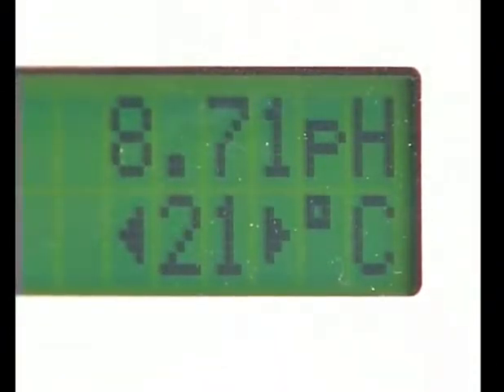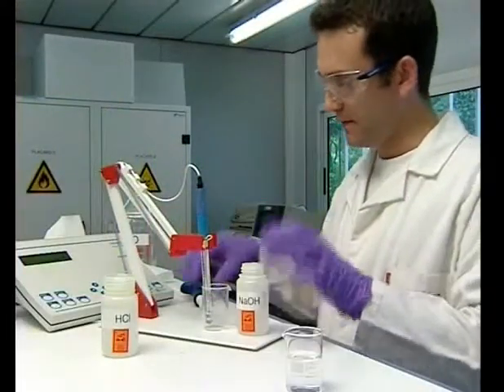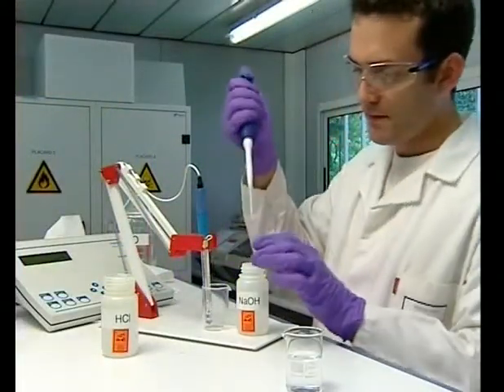In order to show you the difference with other washing solutions, we will carry out the same experiment on caustic soda with tap water.